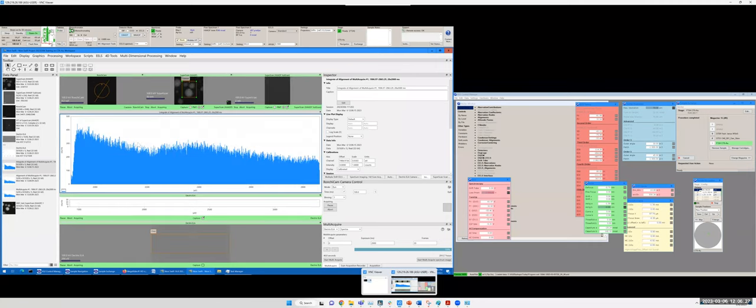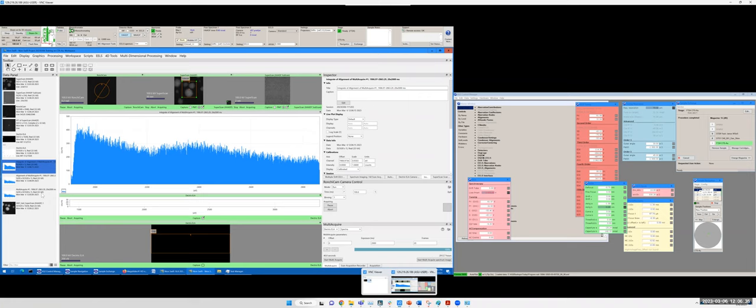You can see roughly here is a bumpy signal, right? This is the gold signal. Okay, we can type in something like gold. This is gold, okay. So this is done for this.